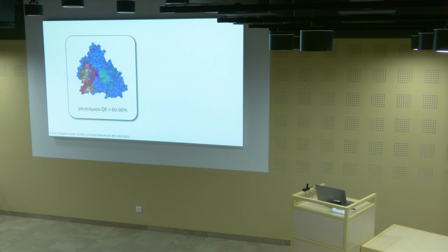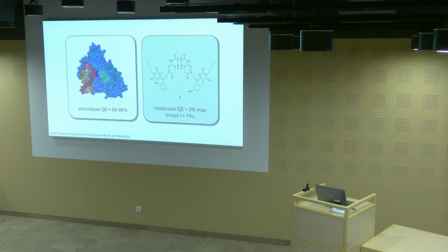And so now I want to tell you a little bit about what open questions we targeted with our work that were uniquely answerable by time-resolved crystallography. And really, at the heart of this enzyme is a high quantum efficiency. And that's something that we're really interested in studying in as much depth as possible and is an ongoing topic of our work, actually.